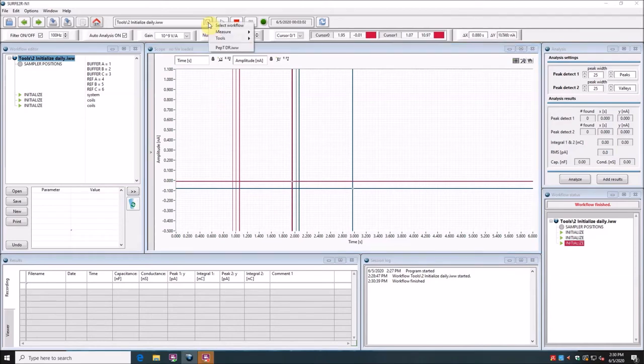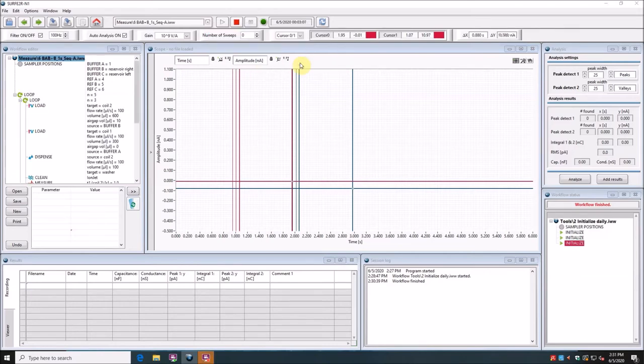There are a few preset workflows you can choose from. But any workflow can be adjusted manually and workflows also can be built from scratch. Here we select our standard workflow number 6. It opens in the workflow editor on the left. Let's adjust the workflow for our experiment.